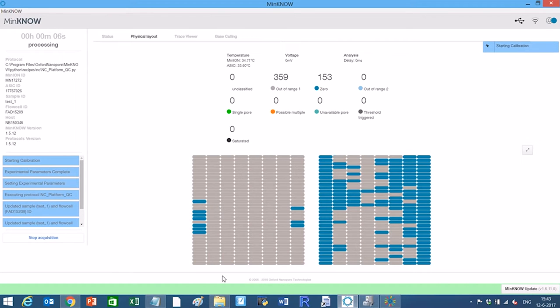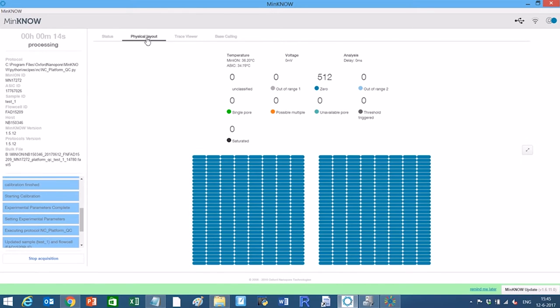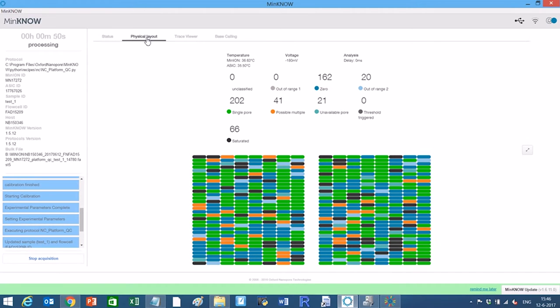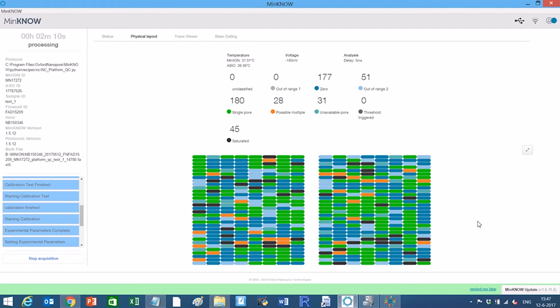Flow cells are shipped with a QC DNA molecule present in the buffer. This molecule produces a distinctive nanopore signal. The MinION software uses this signal to validate the integrity of the nanopore array before use and provides the user with an estimation of the number of simultaneously available channels for the experiment.